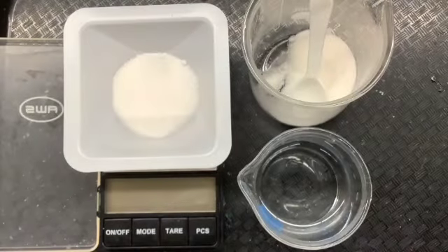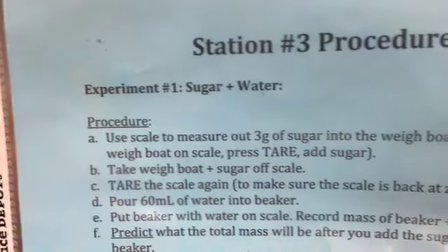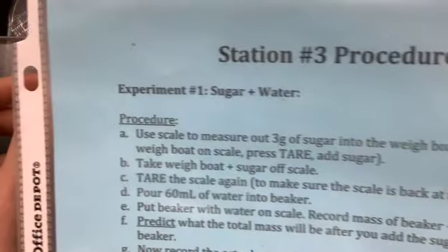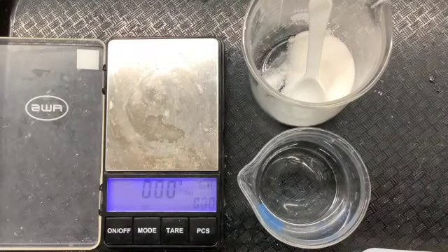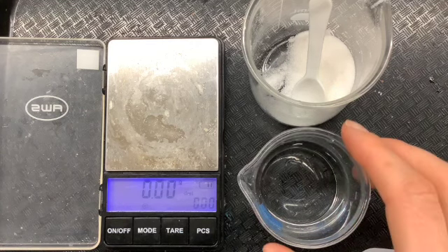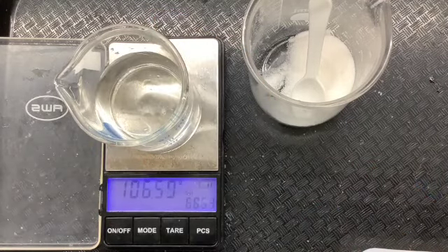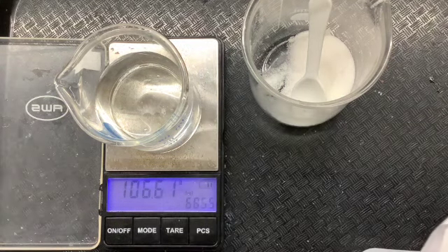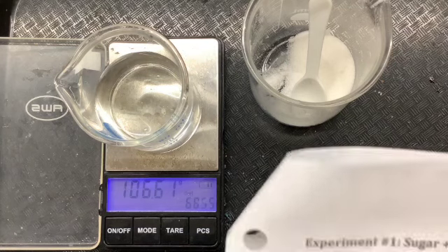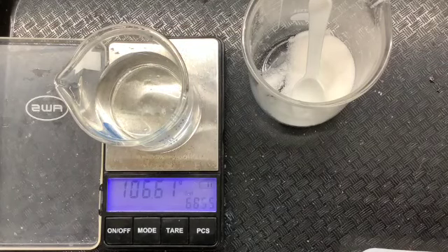All right, so on this procedure, it says use the scale to measure out 3 grams of sugar in the weigh boat, and I have 3 grams of sugar. The next step in our experiment is to pour 60 milliliters of water into a beaker, which I have right here, and then put the beaker with the water on the scale and see how much our beaker plus water weighs, and we're going to write it on our paper. 106.61 grams. I've written it right there.